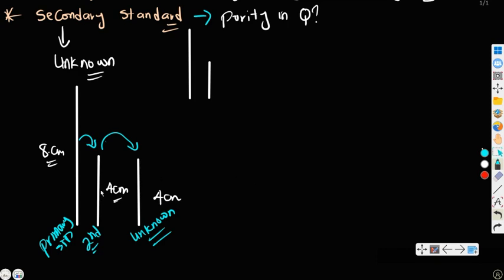For instance, let's say this is a particular compound given, and this is a particular compound, and I give you 1:1 as the molar ratio. It means that both of them will have the same height, true or false? Now, what do you think is the molar ratio between this one and this one? 2:1. Are you getting it now? So the molar ratio actually gives you an idea of what you are to do.